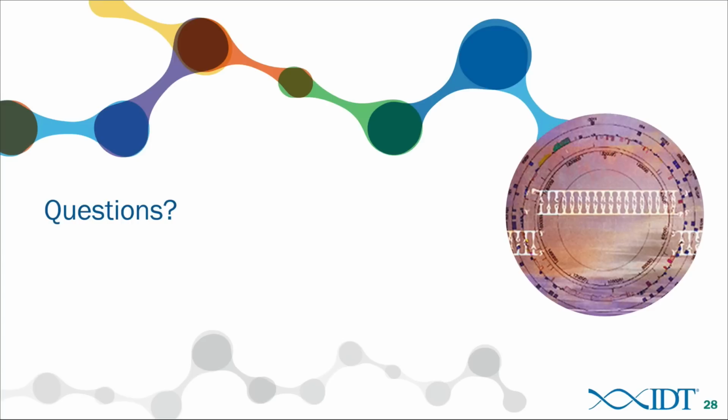So pooling 500 to 1,000 CRISPR RNAs in a single experiment and then doing the transfection? I guess I'm not exactly sure. Yeah, I guess we'll have to follow up with them. Maybe they can clarify their question a little bit. Or perhaps they're discussing a screening library. I'm not sure what exactly the question is.